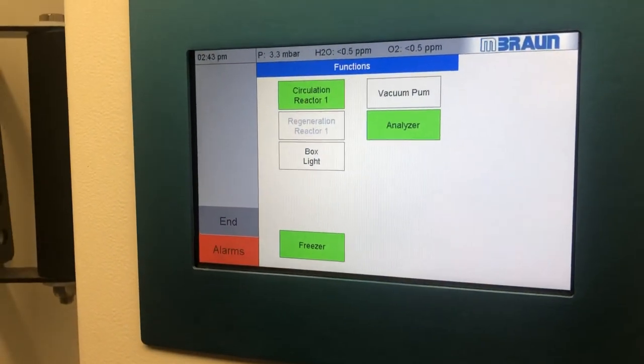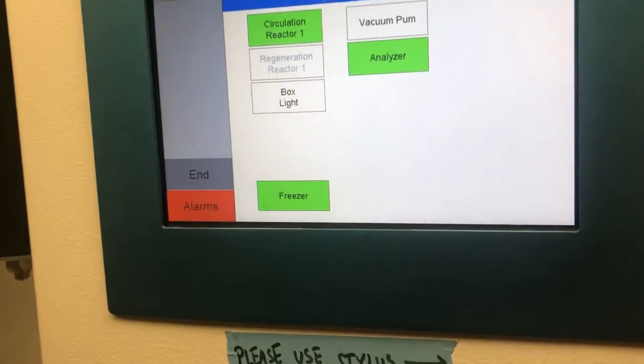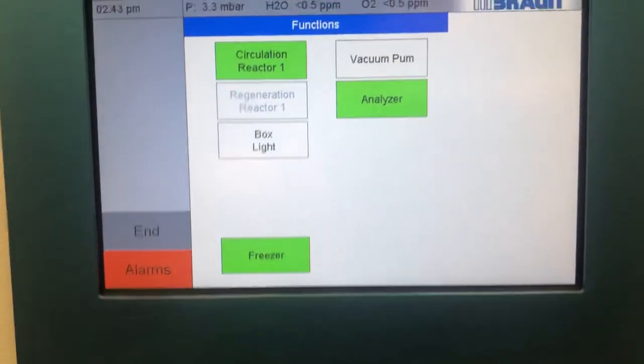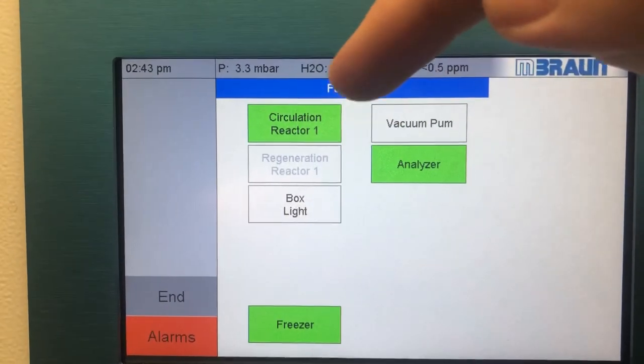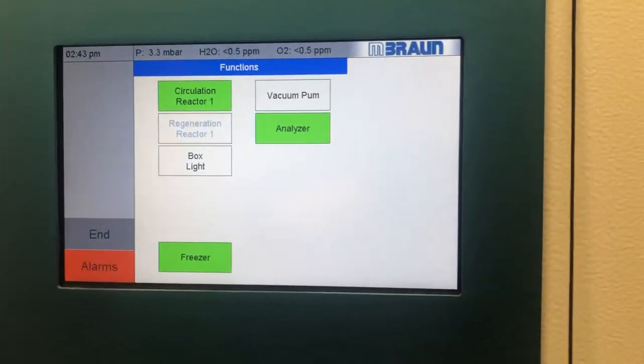Go to the purging video in order to understand this further. But never touch circulation otherwise.